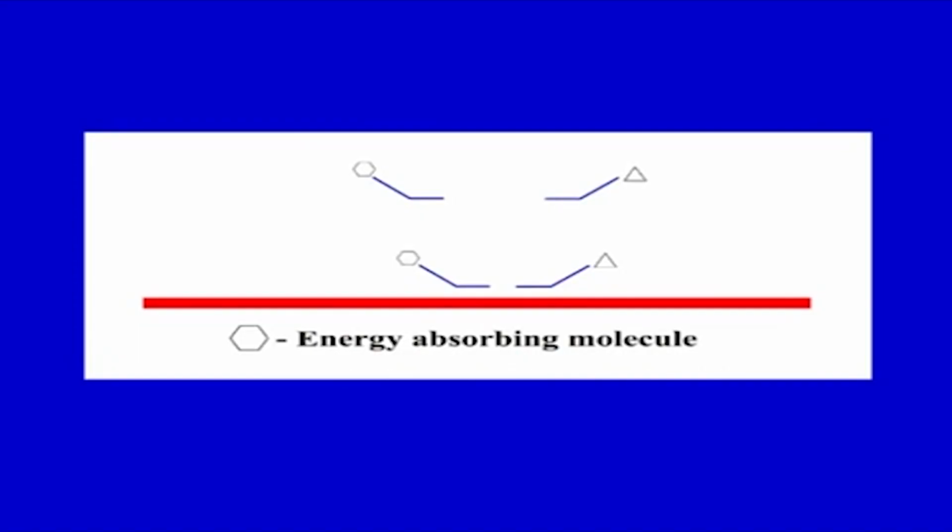DNA. So, as you see, when these two targets come together, that is, are brought into proximity, only then is the measurement of the amount of fluorescence provided.